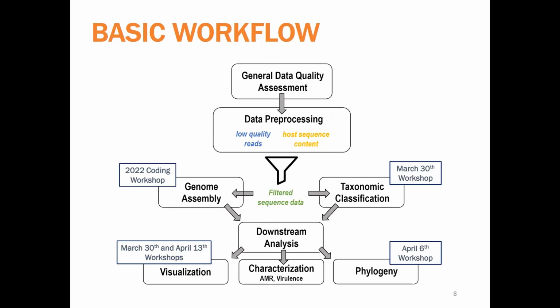And then taxonomic classification, which was part of our March 30th workshop this year. And then your sequencing data is ready for downstream analysis. So different things like characterization, looking for antimicrobial resistance genes, virulence genes, looking at the phylogeny of the sequencing data, which is what we're doing today, as well as visualization, which we're going to focus on for phylogenetic visualization in next week's workshop.